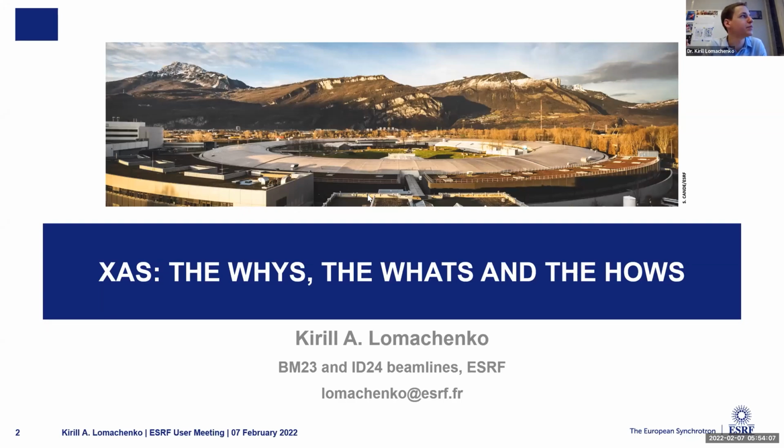But I'm not sure that you can get a good EXAFS at carbon. You will not, and a good EXAFS at boron, not really. So you should use this data as a complementary thing to get information about your system.